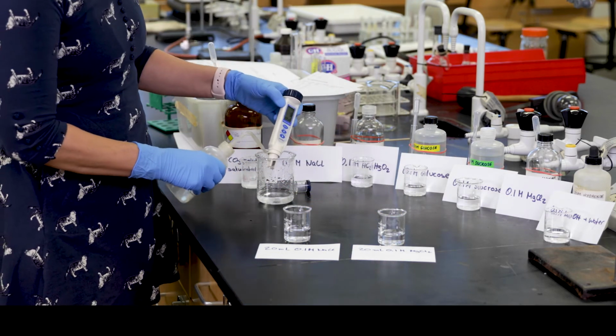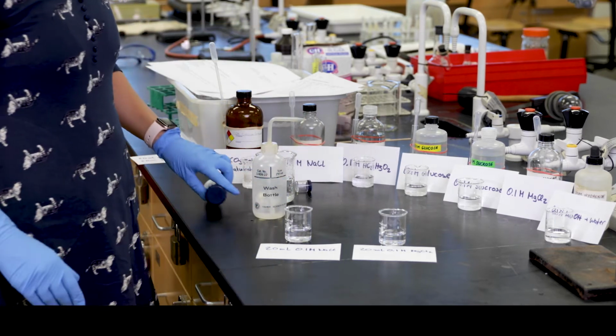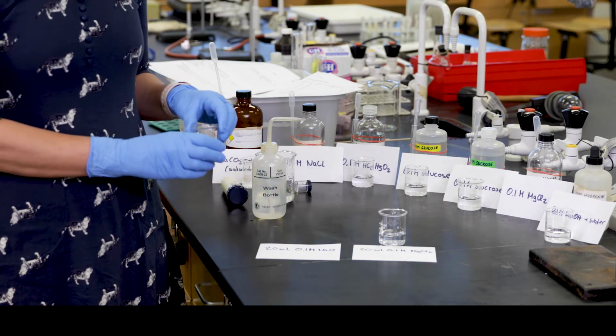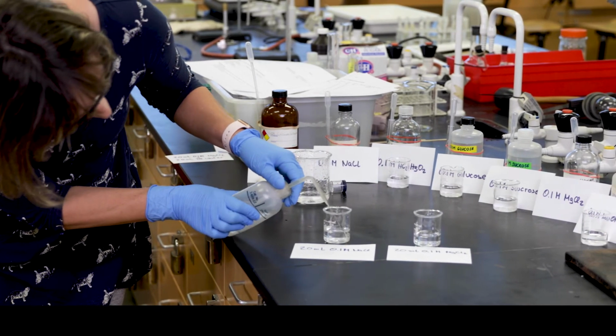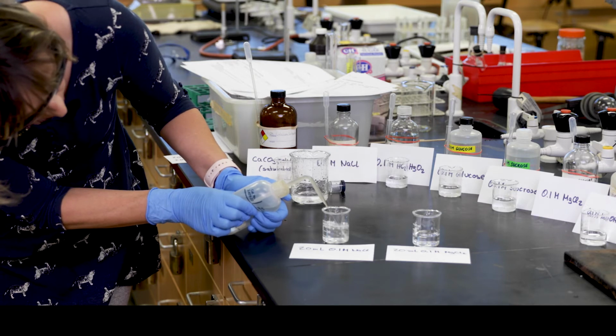Okay, so what we're going to do now is add 20 milliliters of water to each of those beakers and see what changes. So I'll just add some water, pretty much filling it up to 40 milliliters.